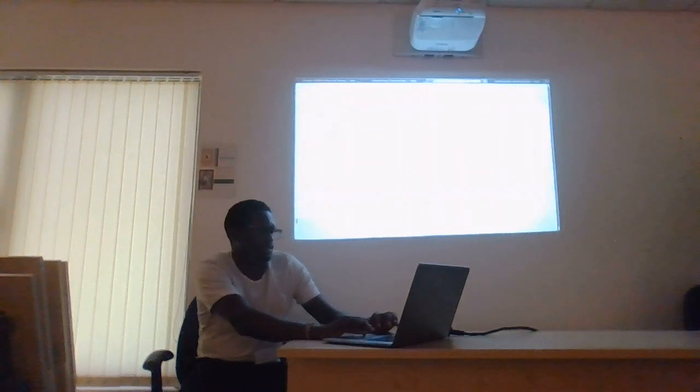Nextflow has expanded this path. It has given me the full path of where those reads are. So if you look at what it prints, it is a full path to where those reads are located.